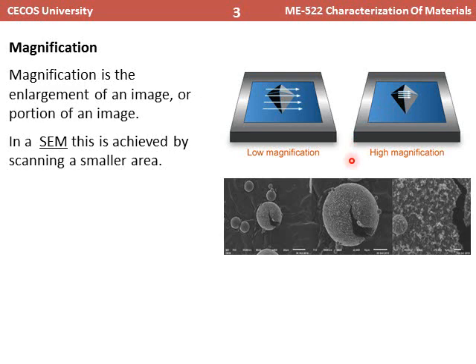The same is translated in the bottom right images. If you move from left to right, you can see that this image shows some artifacts on the surface in a circular form. If you want to view a higher magnification, you move from here to here, meaning a very small portion has to be scanned by the beam of electrons.